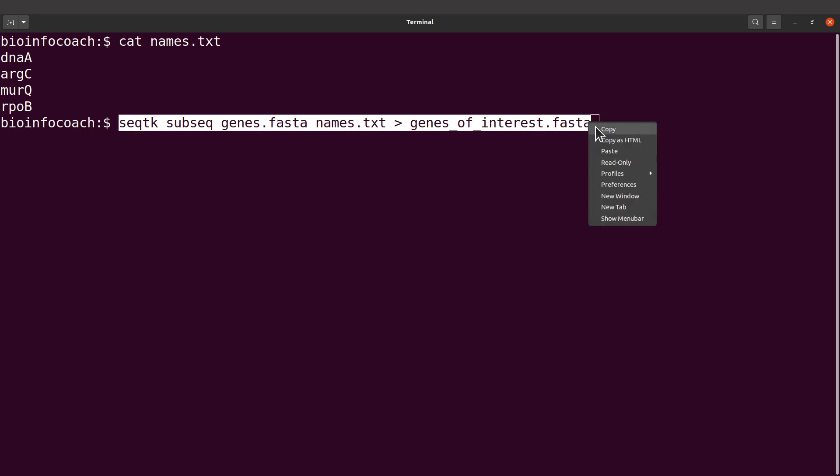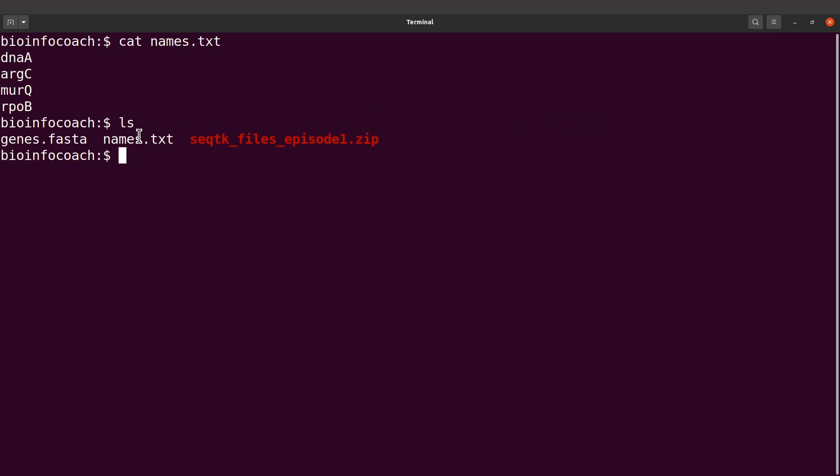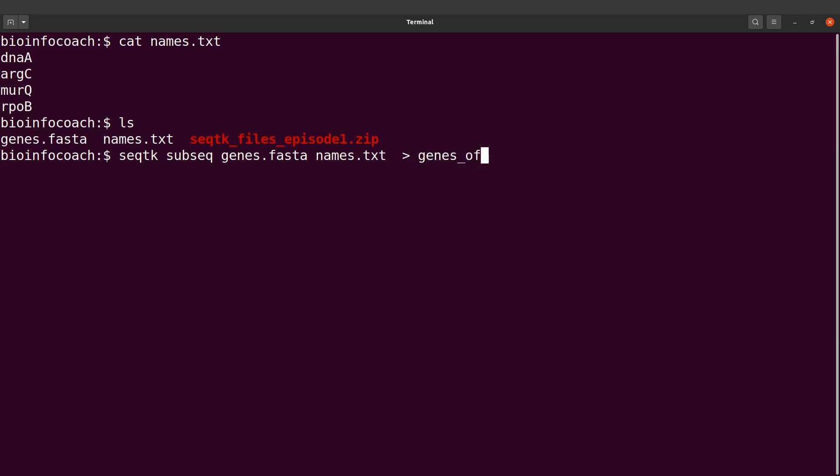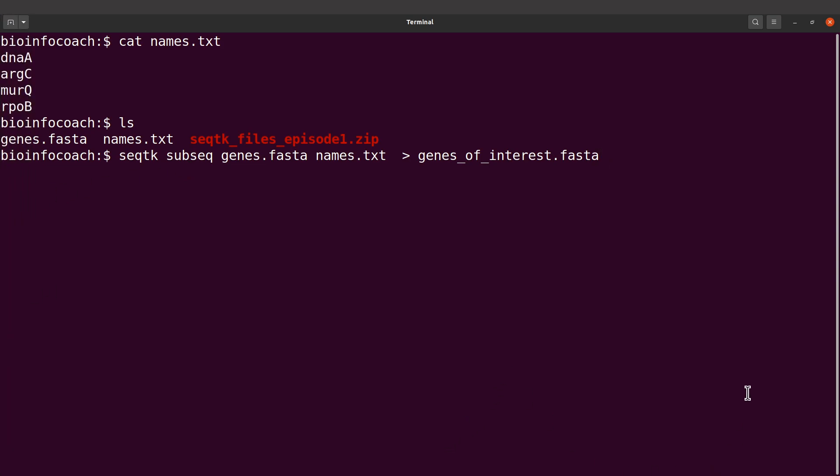Let's first do an ls. Sometimes you may be confused because you don't see the name. You can do an ls first to display the file names like this. Then you can retype your command. I'll say seqtk subseq and then genes.fasta and then names.txt. And then I indicate an output file which is genes_of_interest.fasta. This is the command that we have to use to subset or extract the sequences. Let's execute this command.